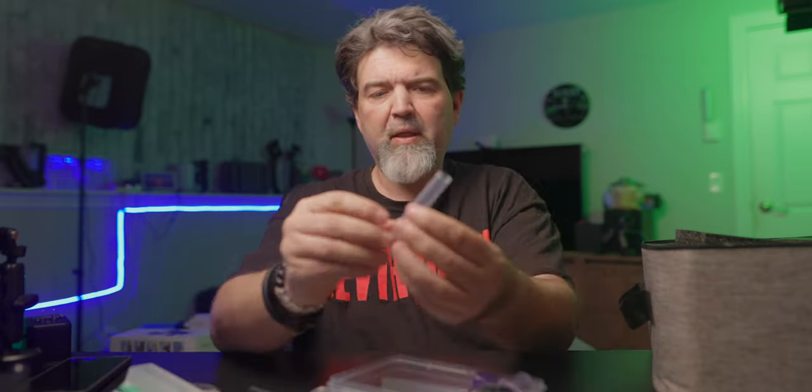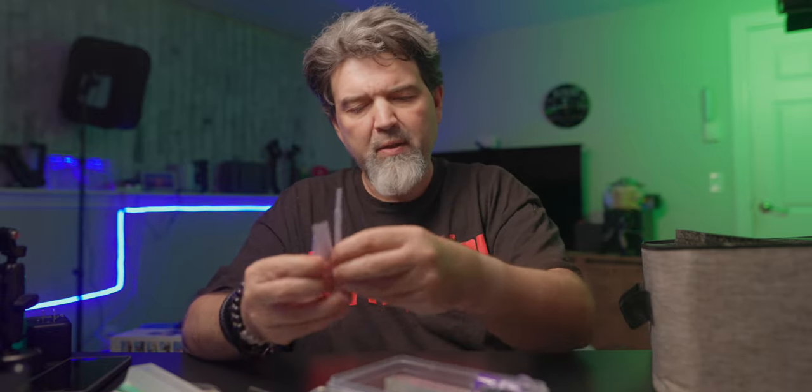It comes with a bunch of stuff - a kit of goodies. For you as an adult or your kids. There are some plates where you put your stuff, and it's all in a different language so I can't necessarily read it. These are going to be your plates to put your samples in. You get little tweezers, little scissors, very nice. And there's a little knife, so be careful if you're letting kids play with this - it has like a little exacto knife.